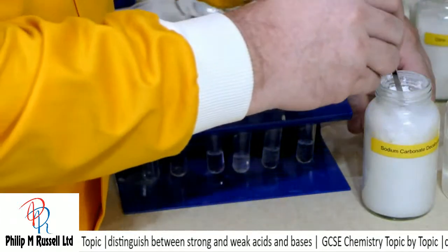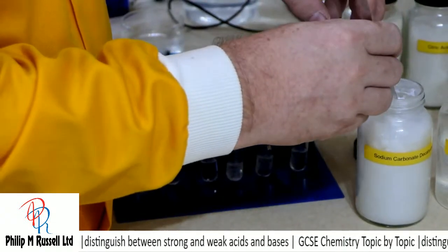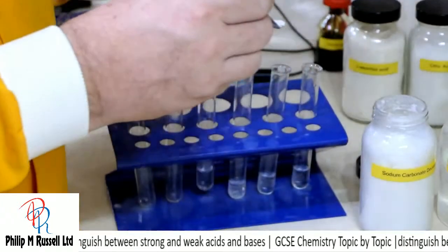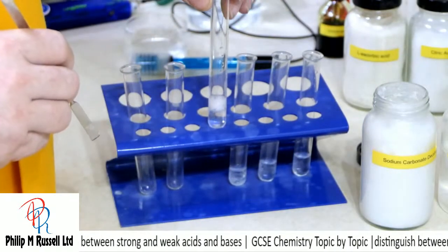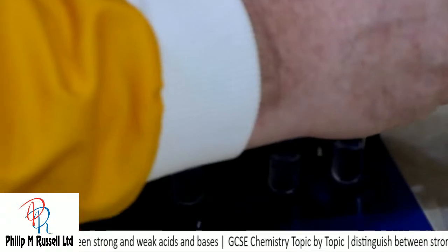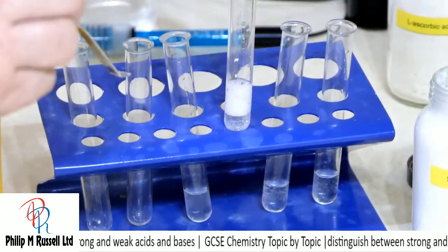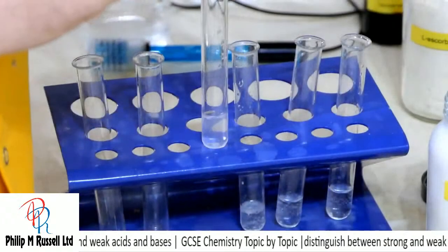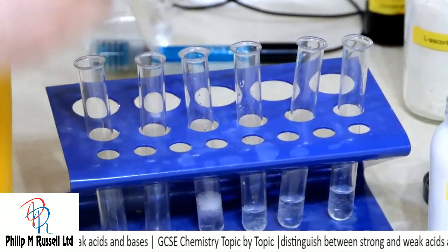Let's take our sodium carbonate. Don't want too much. And here we go. Ready? Well, that didn't appear to be that different to this one. The 2 molar. There's your 2 molar going. There's the 1 molar going. Really not a lot of difference here.